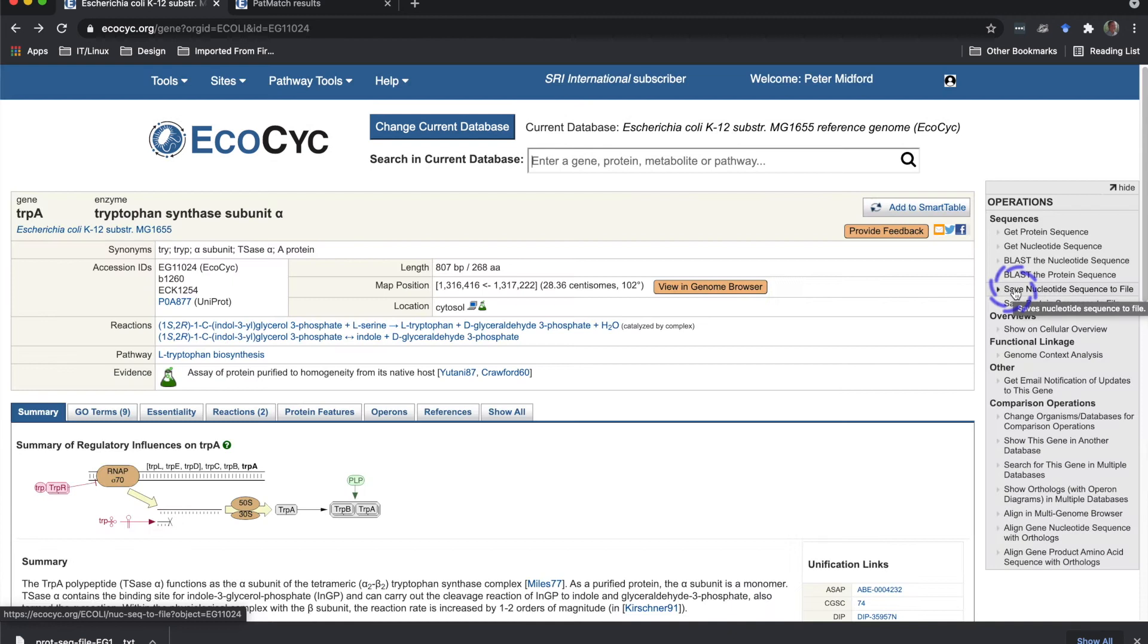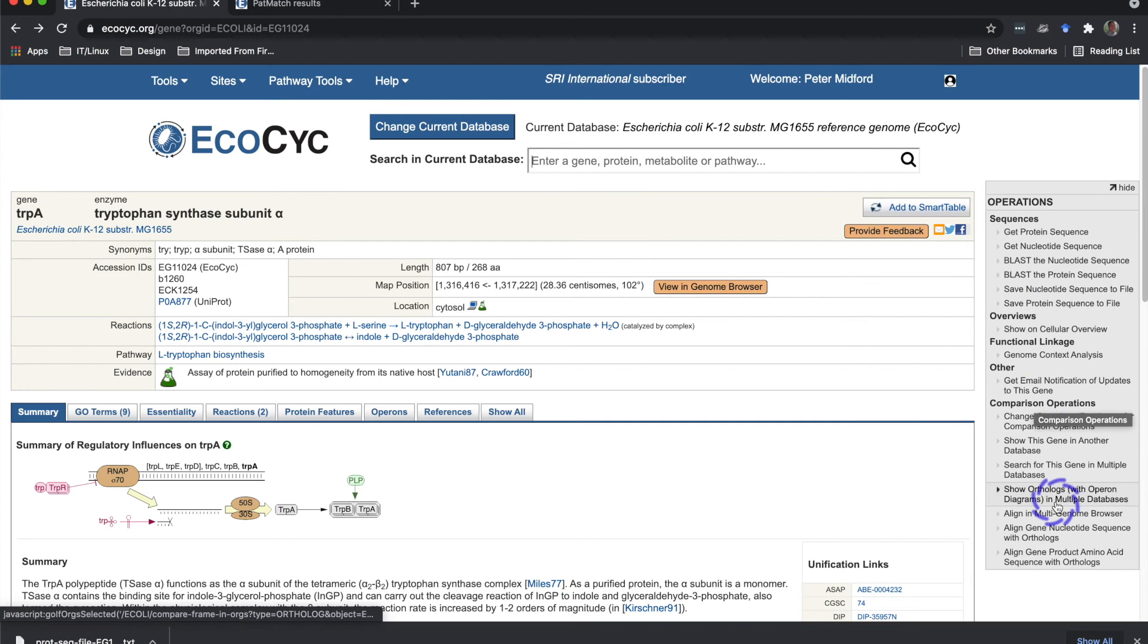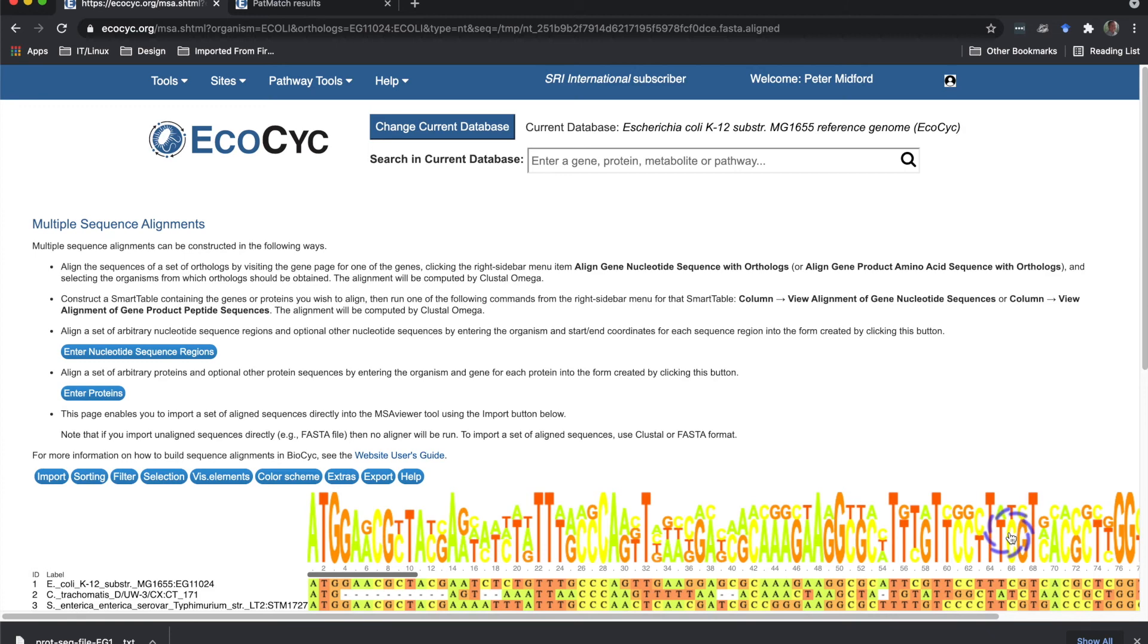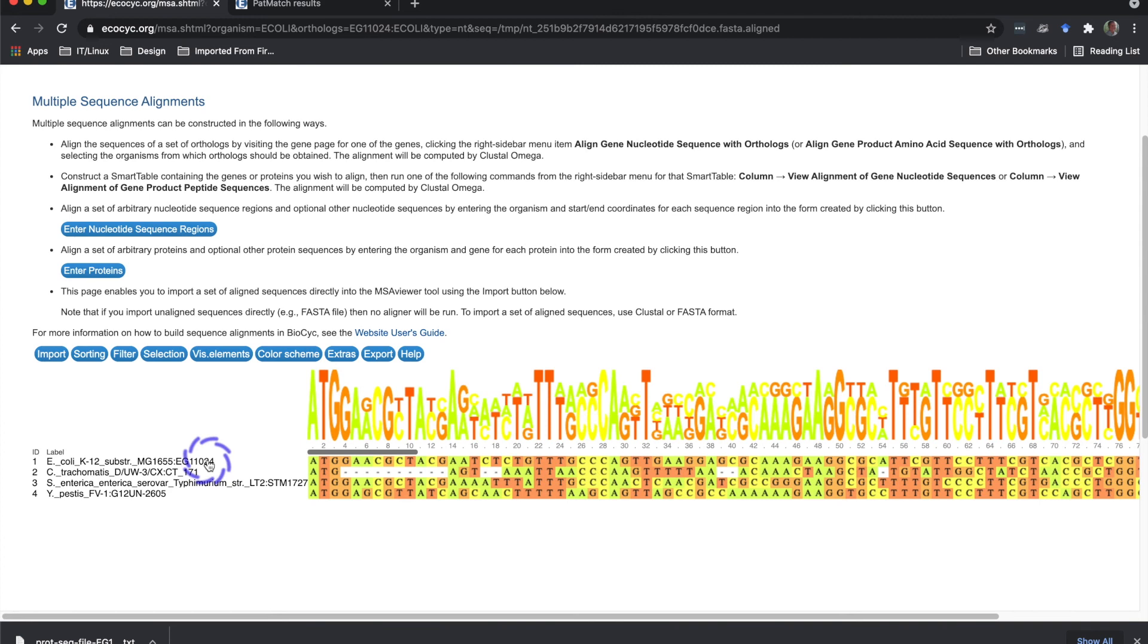Finally, I'll introduce BioCyc's multiple sequence alignment facilities. As with the other pages in this webinar, there are multiple ways to start a multiple sequence alignment analysis. In each case, Clustal Omega is used for computing alignments, and MSA Viewer is used for displaying alignments. Let's go back to the TRPA page, and I'll show you how to show an alignment using all the orthologs of a given gene from the current organism comparison set by starting at the gene page. The command is align gene nucleotide sequence with orthologs. This brings up a multiple sequence alignment display using MSA Viewer. You can find out more about MSA Viewer at their web page, which we link to, but I'll demonstrate some of the features here. The viewer shows each sequence as a row, with labels for each orthologous gene, consisting of the database ID followed by the gene ID.